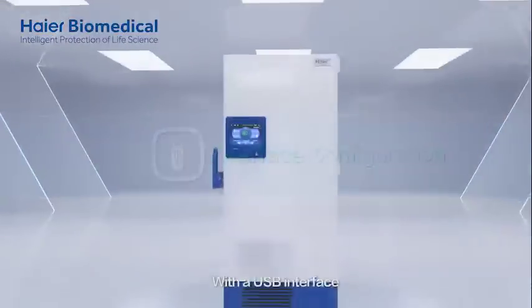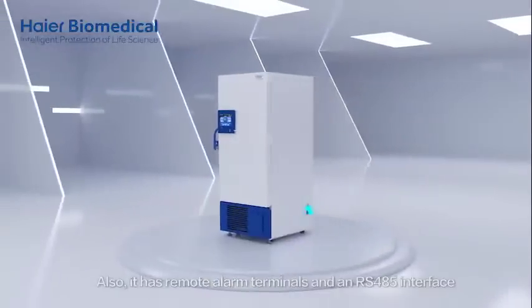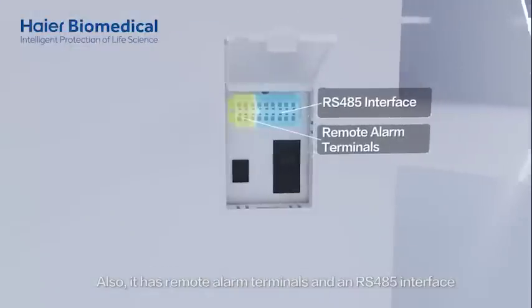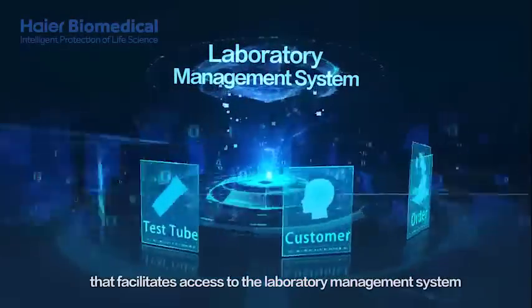With a USB interface, the freezer enables historical data export for up to 10 years. It also has remote alarm terminals and an RS-485 interface that facilitates access to the laboratory management system.